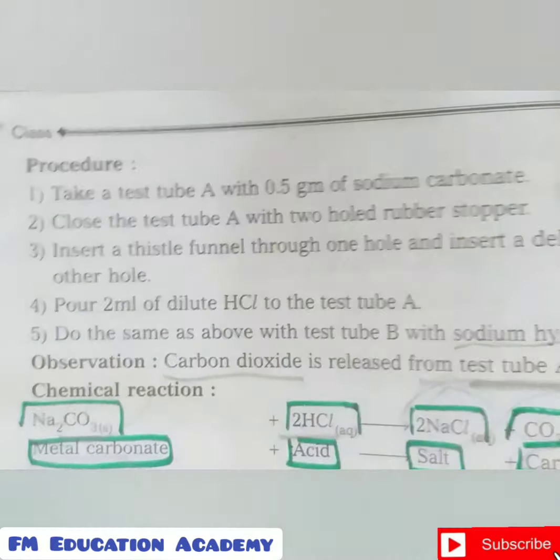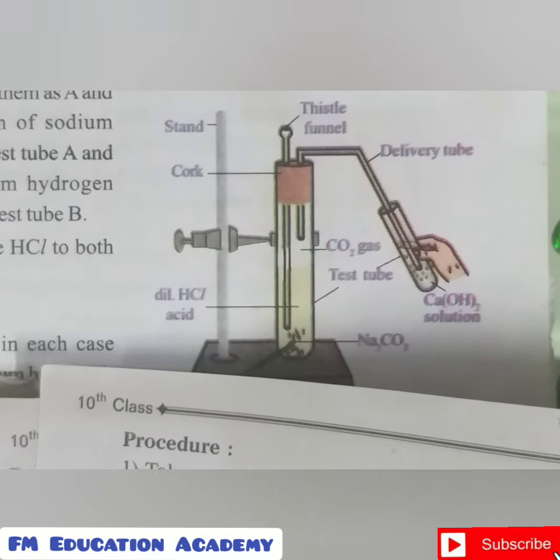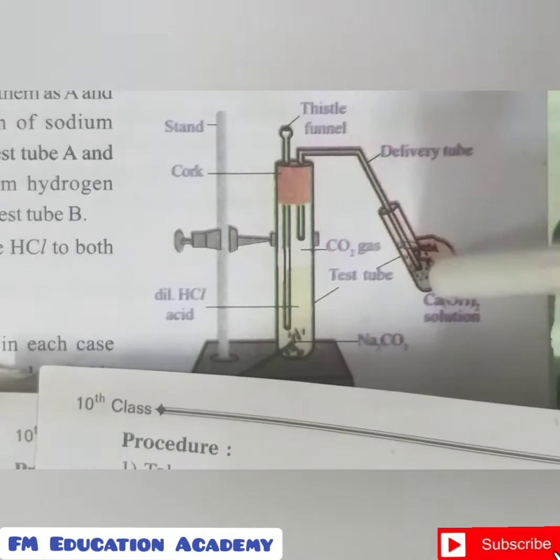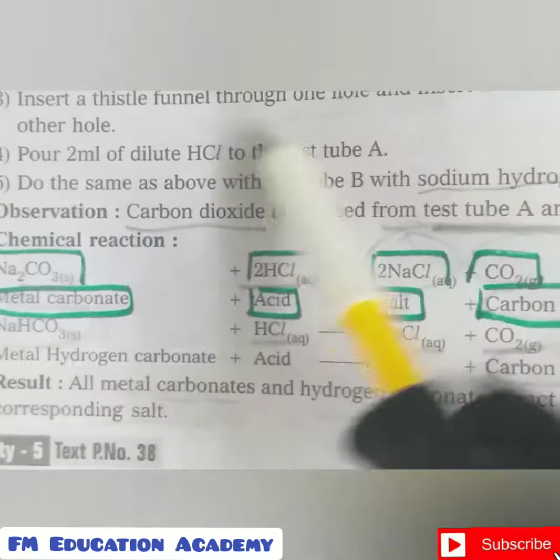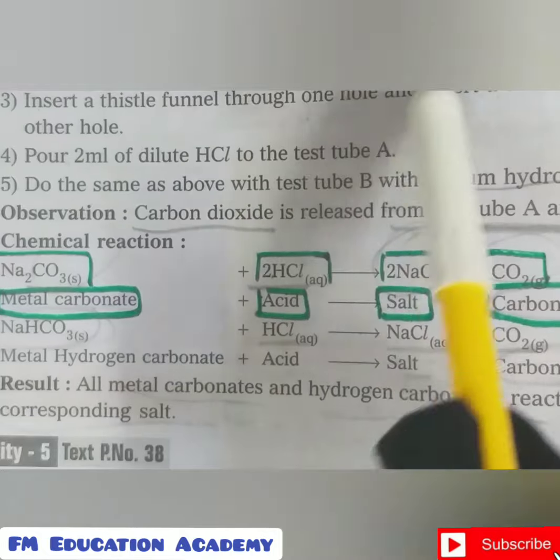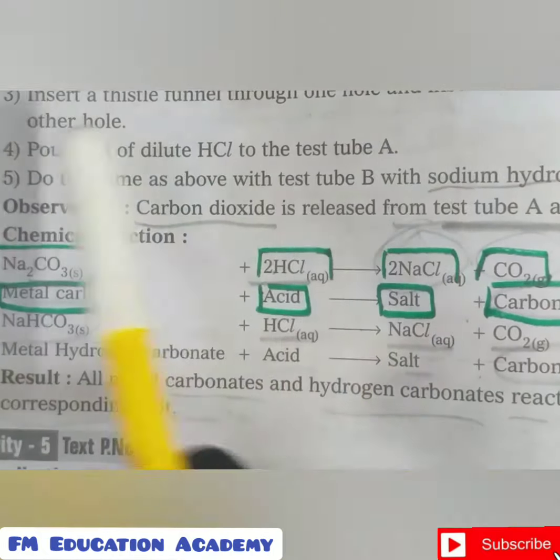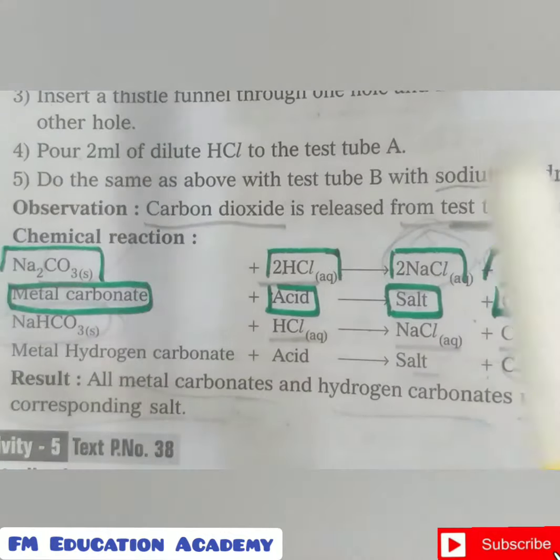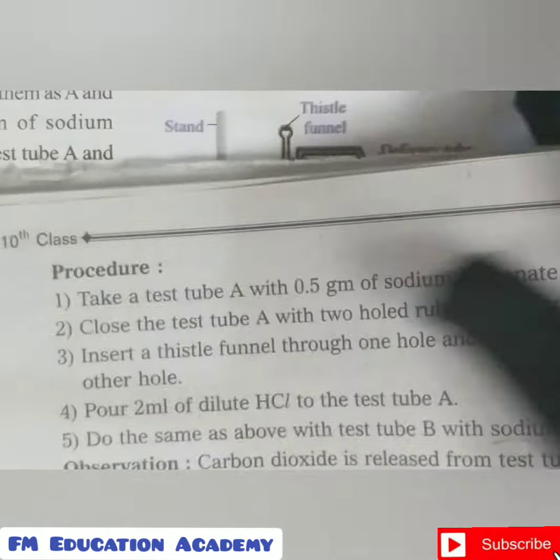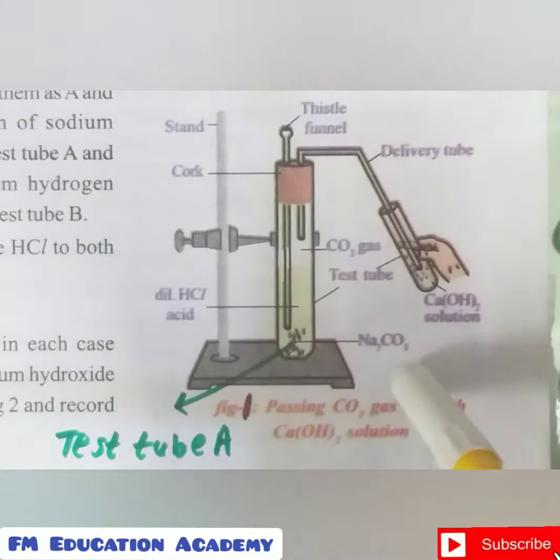Then we are inserting a thistle funnel. As you can see here, we are inserting a thistle funnel inside one hole, and inserting a delivery tube inside the other hole. Then we are pouring about 2 ml of dilute hydrochloric acid into test tube A. Don't see this point, this point will be done afterwards. Whatever I have explained, this figure we are doing now, right?